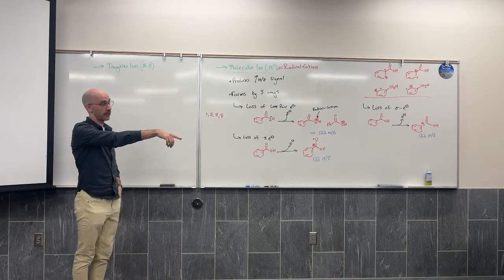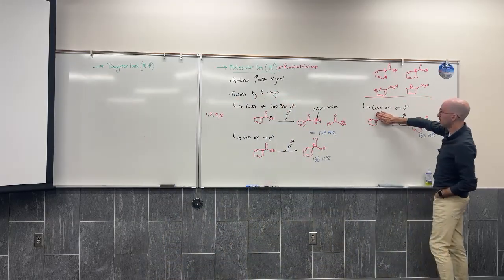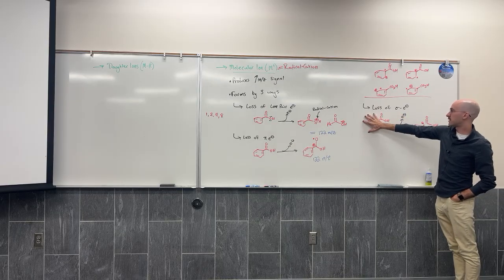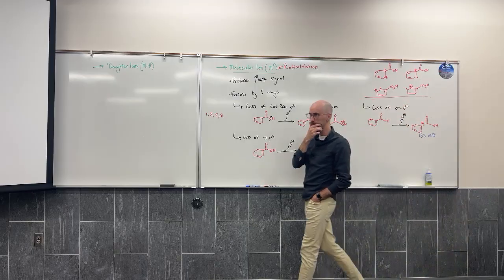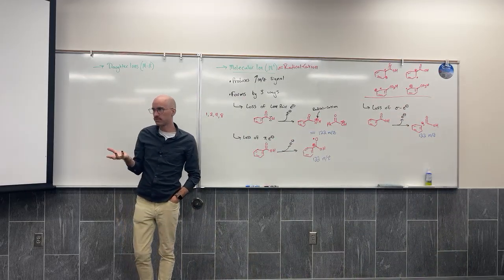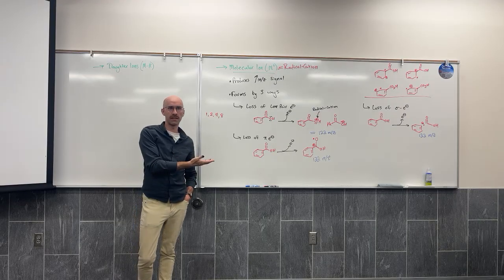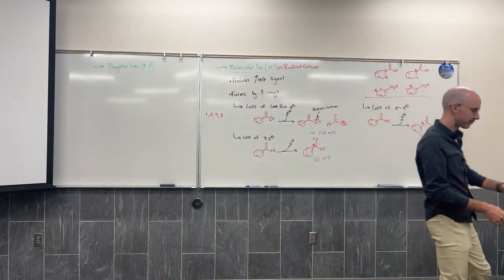One thing that I said, the correlation table tells me that the aromatic ring weighs 77, assuming that there's no hydrogen. So that's 77 plus 32, 1, and 12. You are allowed to bring a calculator to the midterm, but I rarely see students need a calculator on the midterm. This would be the only thing you might want it for. It's not really that necessary.